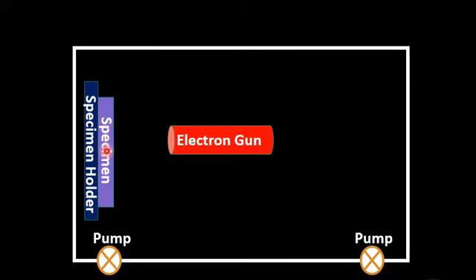However, the average penetration depth of the Auger electron emission is in the range of 5 nanometer. So when the energetic stream of electron beam is incident on a specimen surface, it will emit Auger electrons from the sample surface in the range of 3 to 10 nanometer.